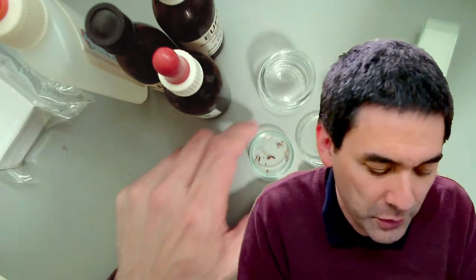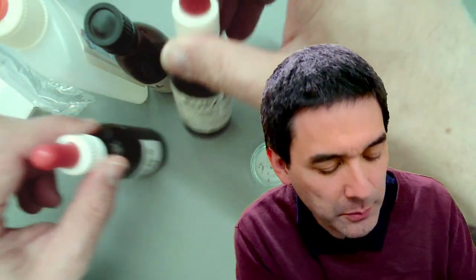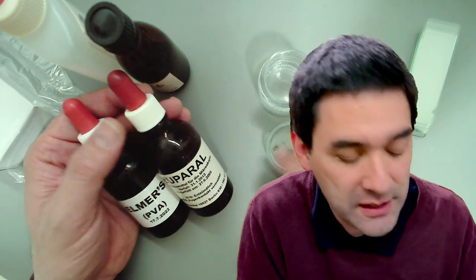Great. So first of all, a little bit of theory. Theory has to be, okay? And some advice. And if you have watched some of my live streams and videos before, some of the things might sound a little bit repetitive, but I think it's still important. So I hope you don't mind. The first thing is the following. Lesson number one, not all mounting media are easy to obtain. That's a problem. What I will be using today is two types of mounting media. One which is very easy to obtain, and that is Elmer's PVA glue.